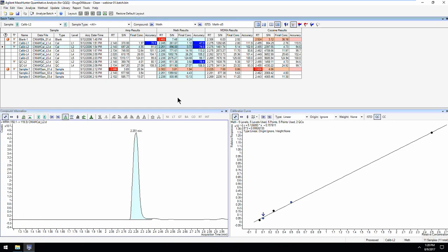So taking out any noise is not really influencing this extracted ion chromatogram. The nature of the extracted ion chromatogram is already getting rid of that noise. So we're not worried about that. All that we're doing with dynamic background subtraction is subtracting out the noise in the TIC.